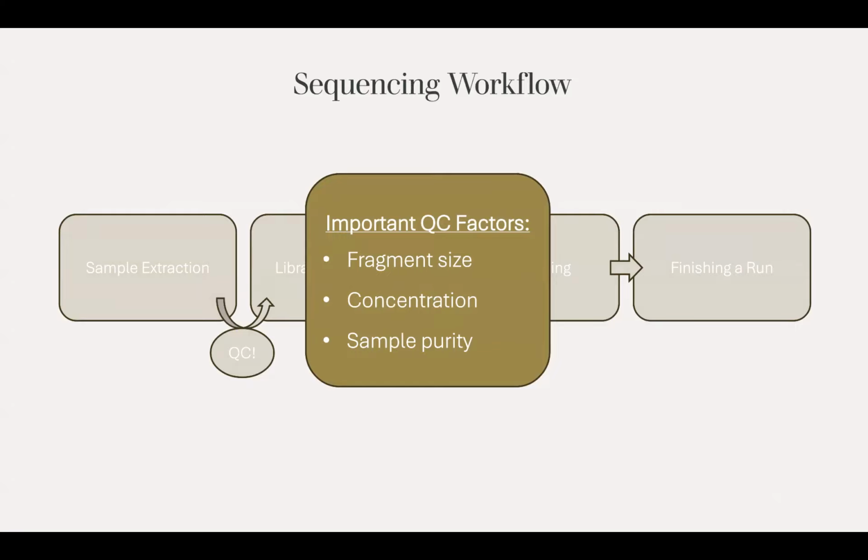Some tips for extracting RNA from samples. Proper RNA handling technique is really important here, especially with this library prep protocol for ONT sequencing. You want to prevent RNase contamination to the best of your ability. We use RNaseZap, a super easy reagent, just spray on the benchtop, spray on the hands. Work over ice when possible, and aliquot to reduce freeze-thaws, as these things can degrade your sample and lead you to lower data quality.